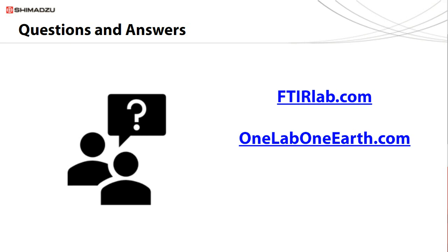Thanks, Sudhir. I have just one quick follow-up question. You mentioned that you have libraries built with UV and thermal, that the libraries have been built based on results from thermally and ultraviolet degraded plastics. My question is, can customers update the libraries, make them their own, and add their own entries?